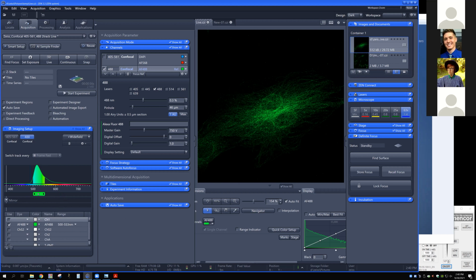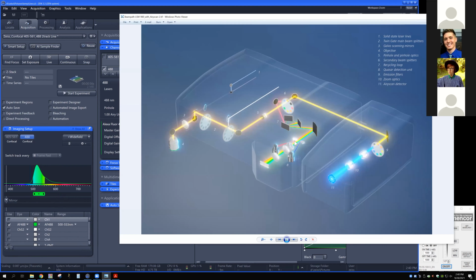What I'm doing when I'm making these adjustments and dragging these is I'm basically adjusting the position of these stops and the hard stops and the prisms that you have here, so that I'm tuning just that range and working with that on the detector.